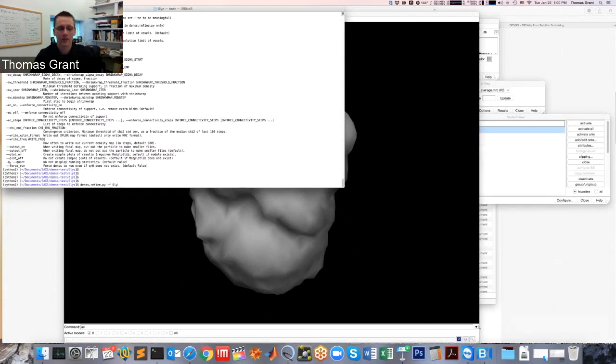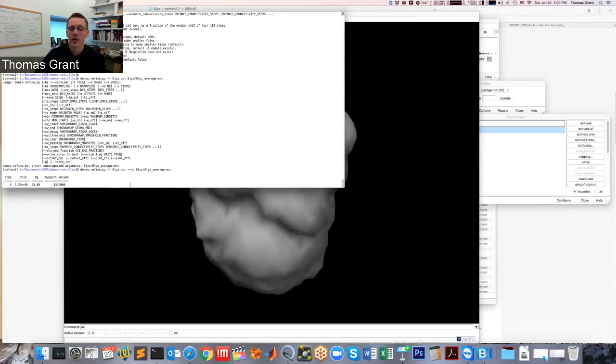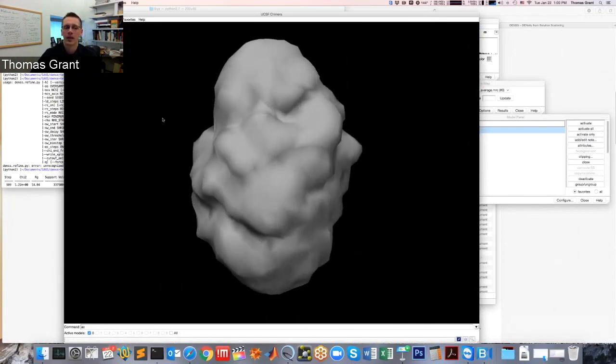You give it the same file, and then you can give it that averaged map, and it'll take that map and refine it. It'll start with that as your seed rather than using a random number. That way, you get the benefits of an averaged map, and you can refine it against the data so that it also matches the experimental data.